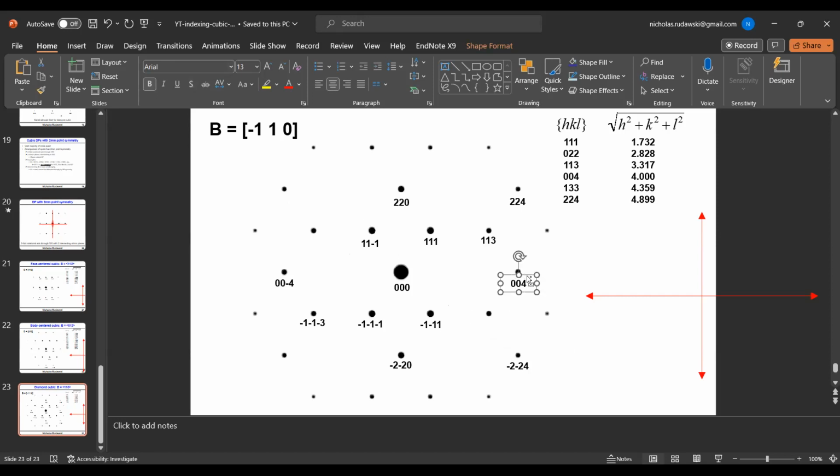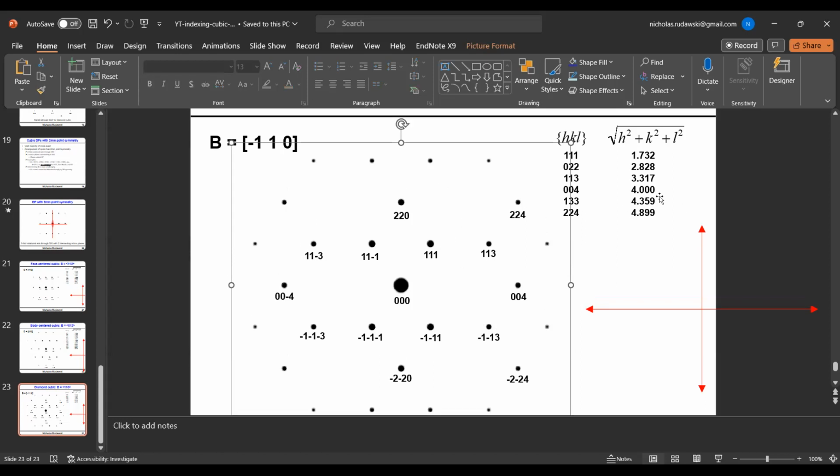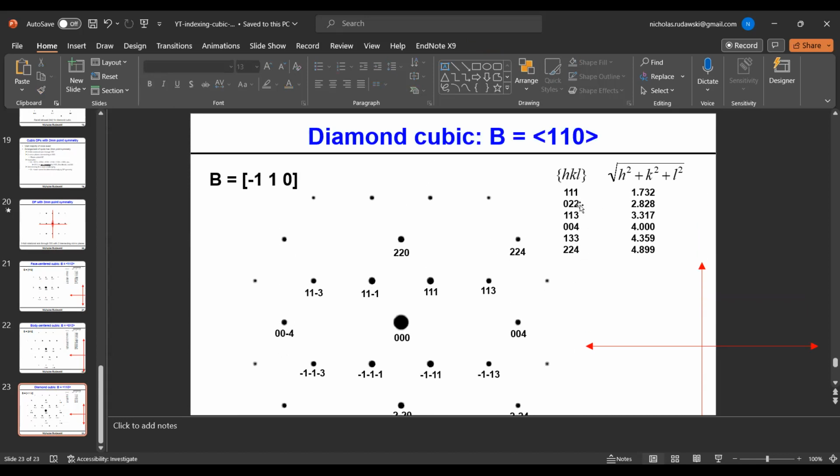Let's do a couple more here. Okay, so this is this plus 0, 0, 2, so that's -1, -1, 3. Okay, and then I'll do one more over here, since that's its opposite. Okay, so now the holes that we see here, okay, we don't see 0, 0, 2 and 2, 2, 2 because, again, they're not kinematically allowed, right? They're not in the list here, okay? So they're what's called kinematically forbidden.